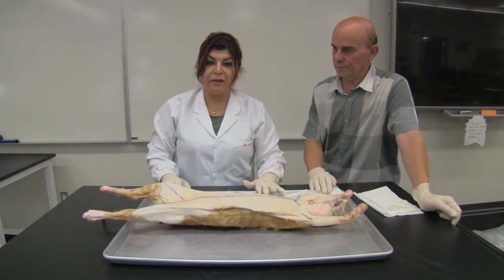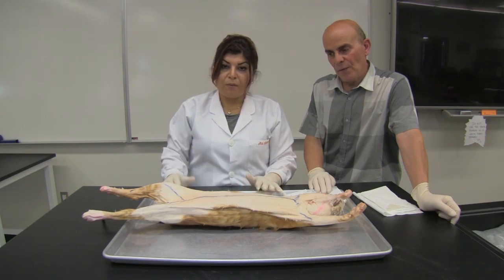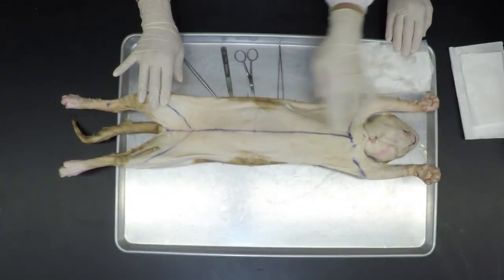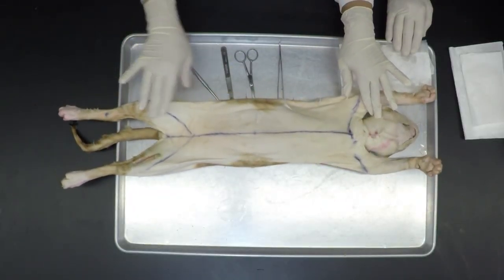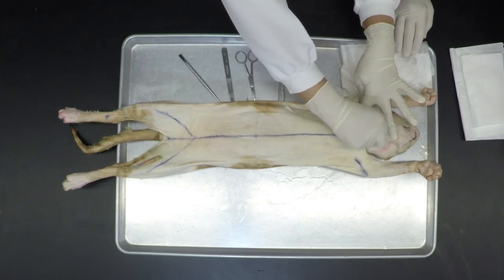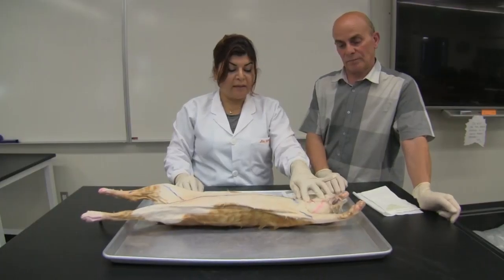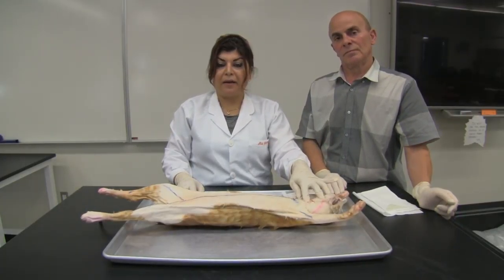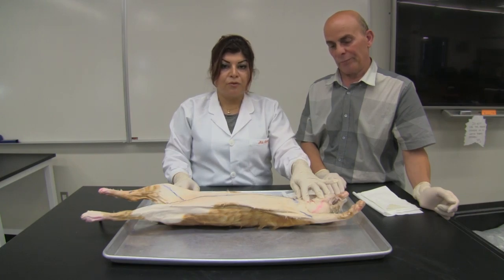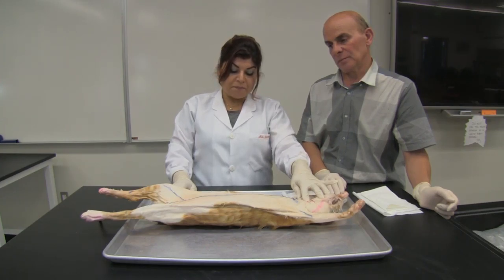The fluid may cause irritation on eyes and skin, but it's temporary, and after you go home, take a shower, and it will pass. You see the cat is clean. You see a hole here where the neck was closed. This opening on the neck is because they take the blood out and inject two different colors, red and blue dyes, so later we can distinguish between the veins and arteries.